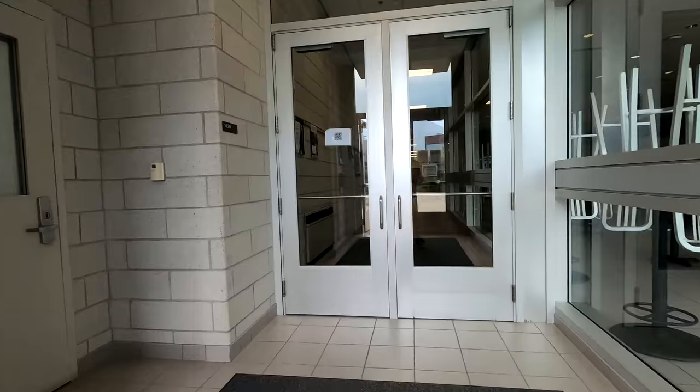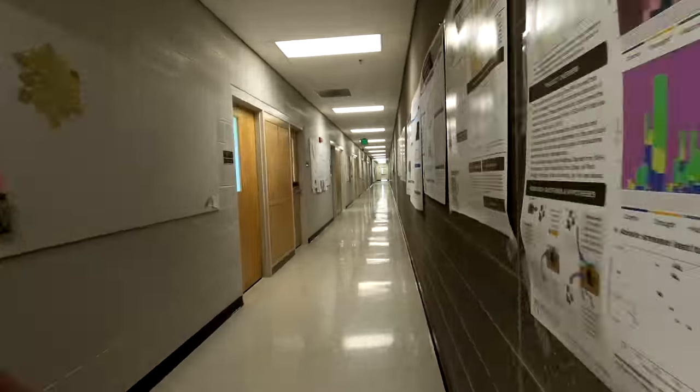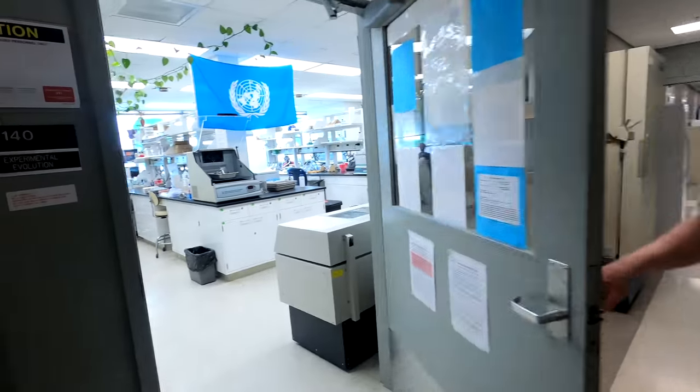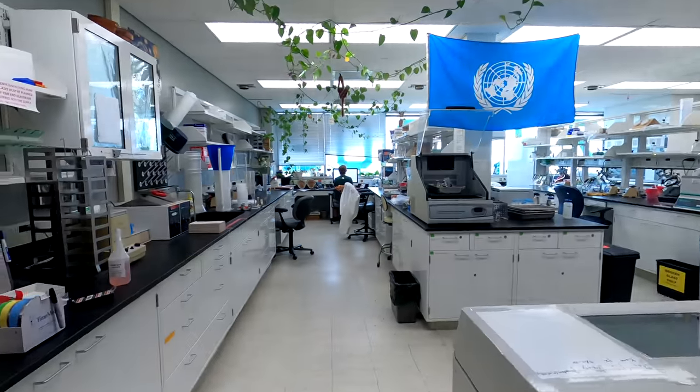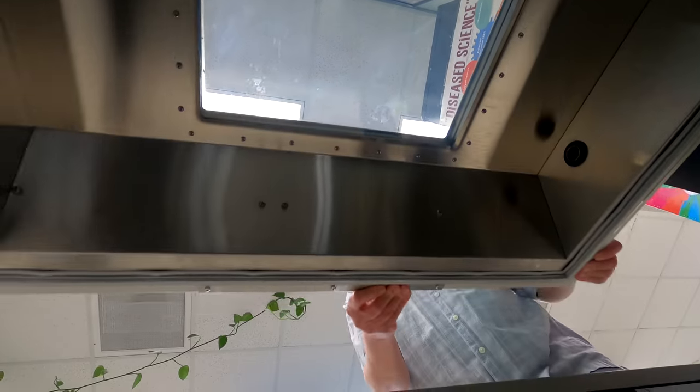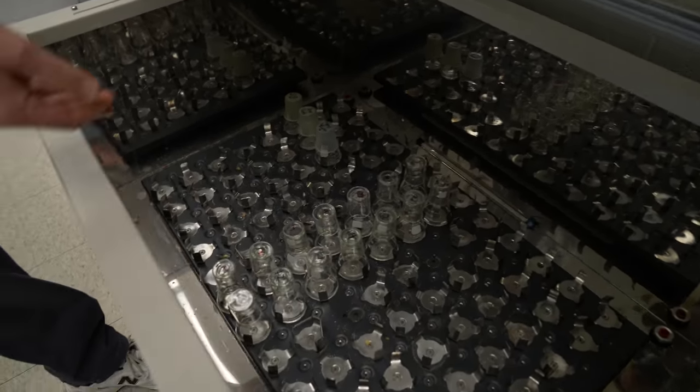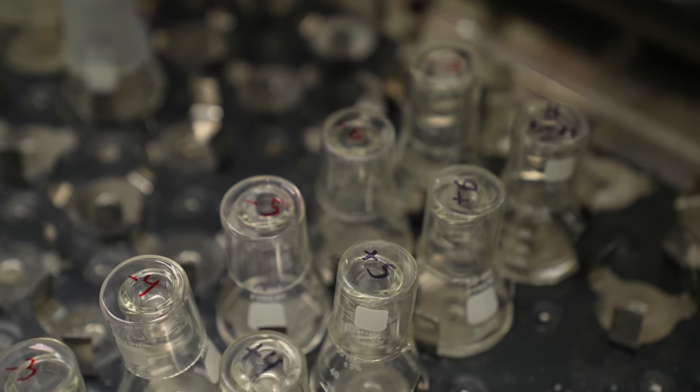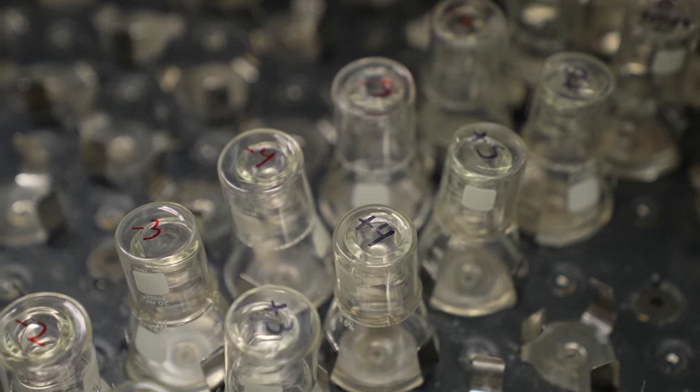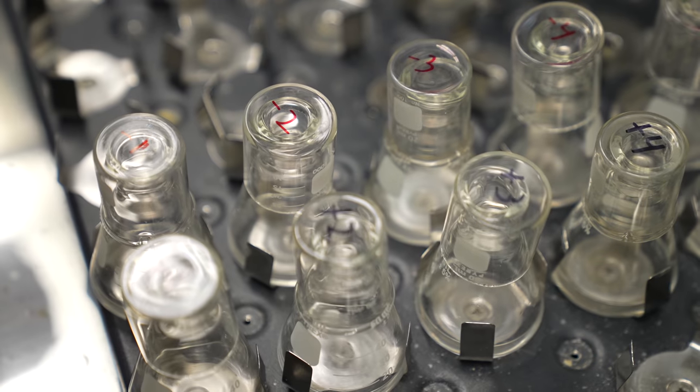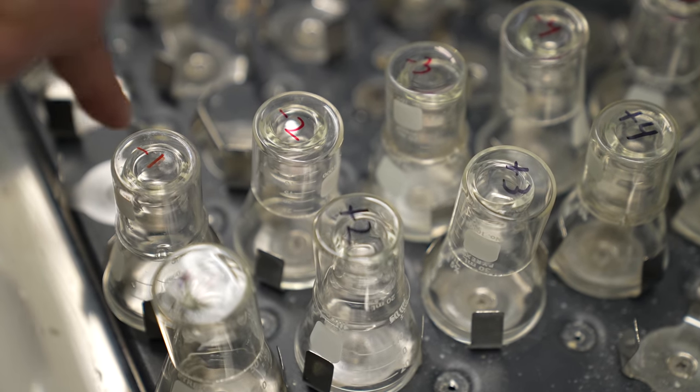This is Richard Lenski. He started the experiment 33 years ago, and along with a team of colleagues, he has kept it going, even on weekends, ever since. In this lab are 12 flasks of live E. coli bacteria. They are the lucky few, the ones that have survived over three decades of evolution in a lab. So there are 12 long-term lines. In 1988, a single common ancestor spawned these 12 separate populations, and ever since that day, they have been growing and dividing independently.